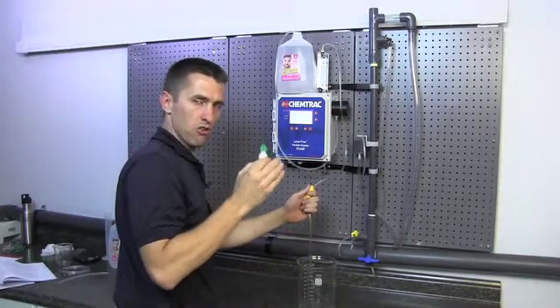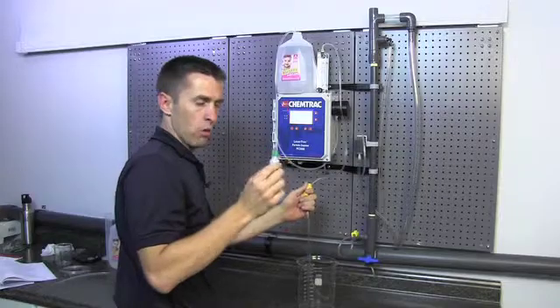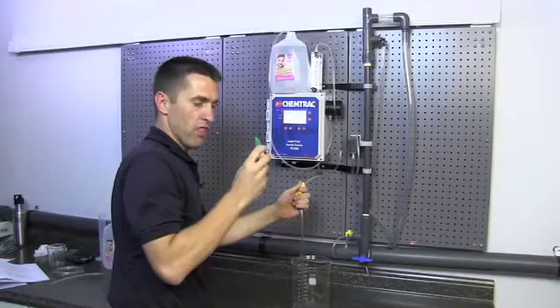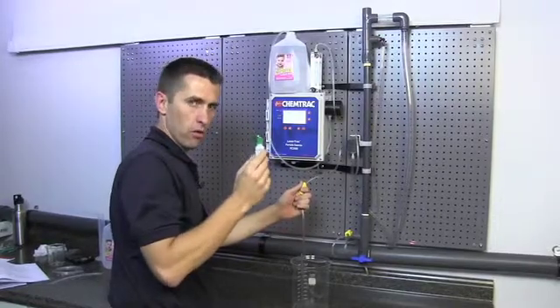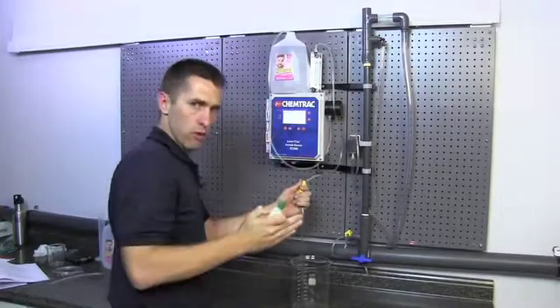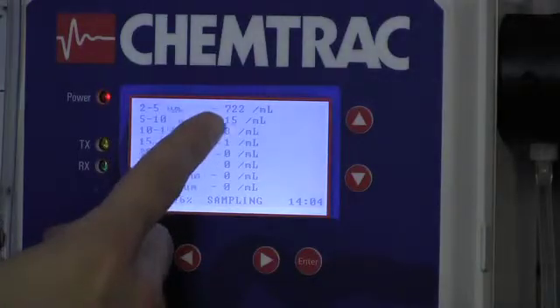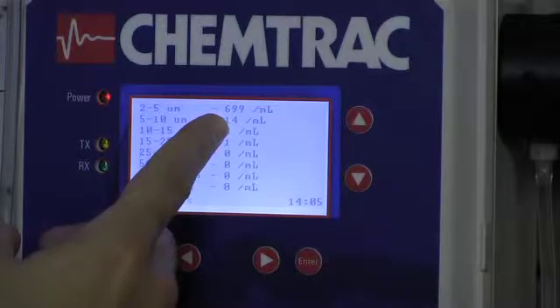So what we're actually looking for on this number here is 1,000 counts, because half of the 2 micron particles are going to fall in that 2 to 5 micron, or the greater than 2 micron bin. So what we want to see is approximately half of the 2,000 counts that we added.